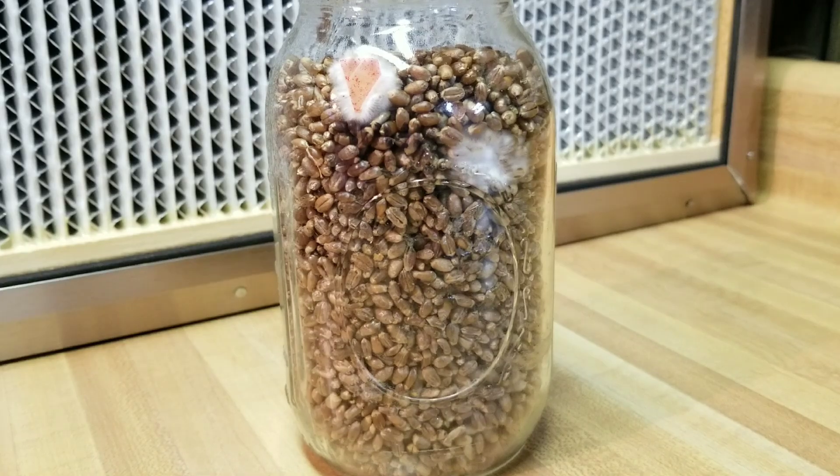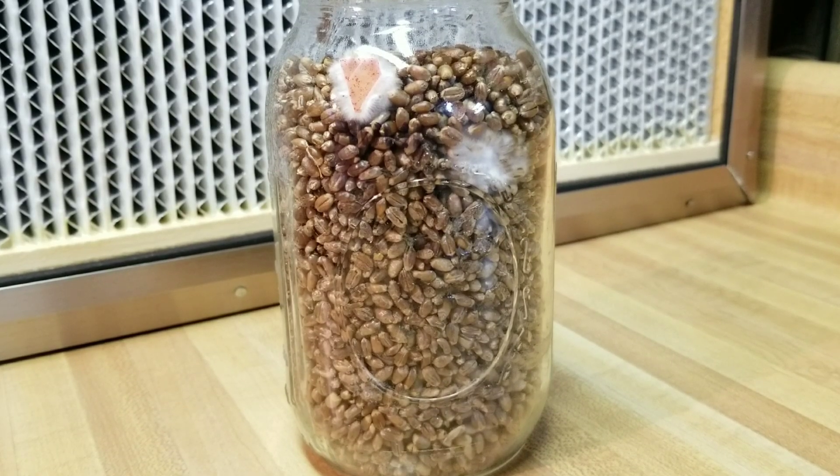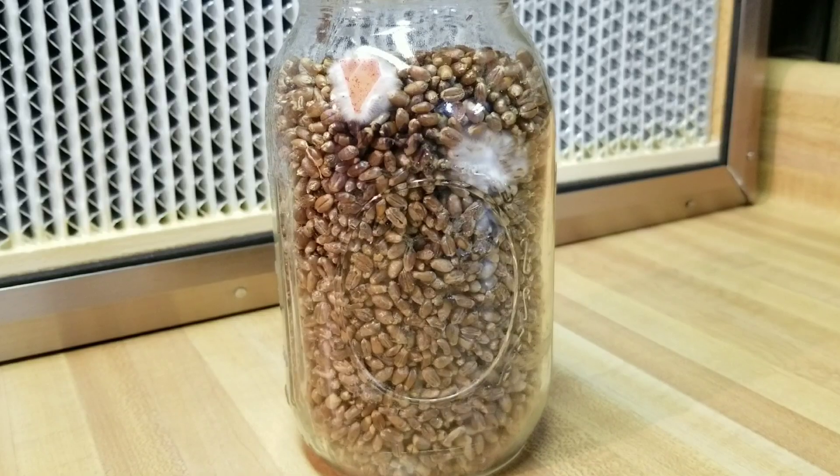It's been five days and my liquid culture jars are just starting to grow - very wispy at this point. Some things to watch out for: strange colors like yellow, black, or green are typically going to be mold contamination. If you see areas of grain that are looking really wet or slimy, that's typically going to be bacterial contamination. Until the mycelium captures your grain they should look just like this. If you do suspect a jar has contamination, separate and isolate it from your others so contamination doesn't spread.